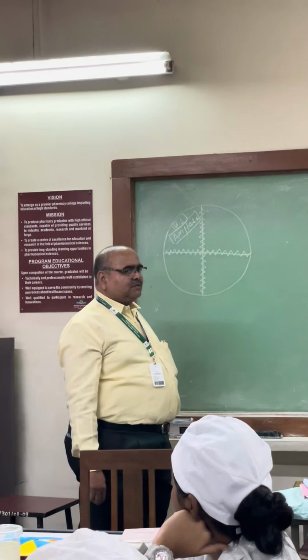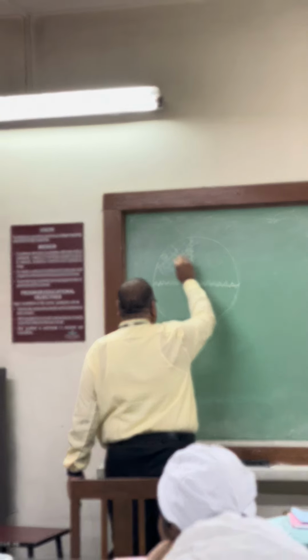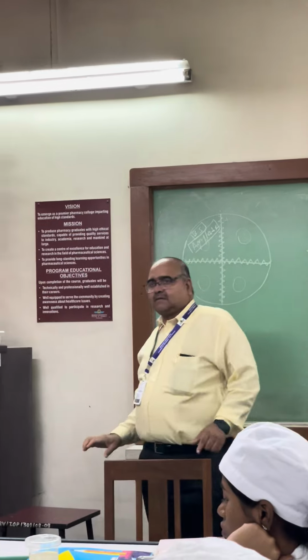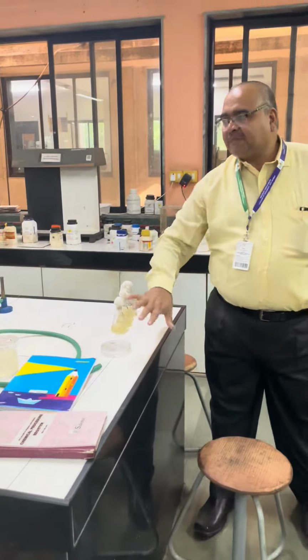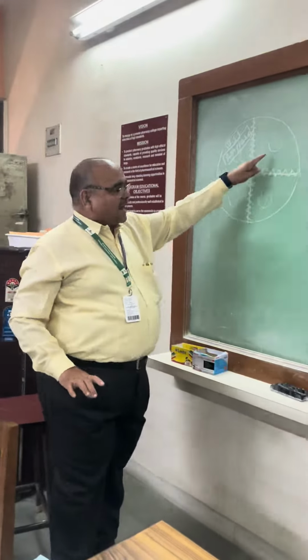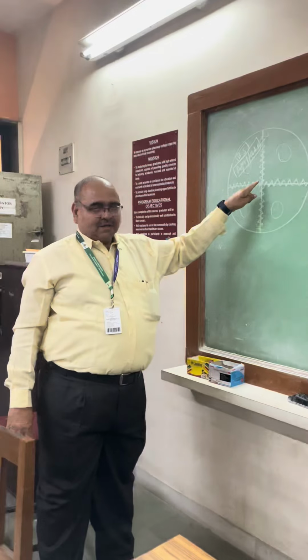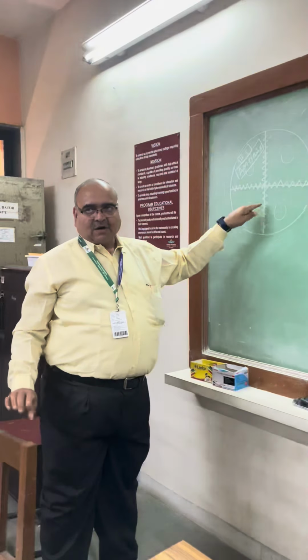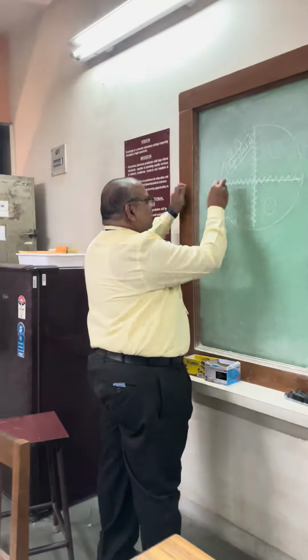After 48 hours, when you come to the laboratory, add drops of dilute iodine solution in these four quadrants, and the iodine will be spread all over the plate. In that area where the starch is not hydrolyzed, you will get blue coloration. Surrounding this inoculation, if the bacteria is amylase positive, you will get a colorless zone, and that colorless zone will be seen in this way.